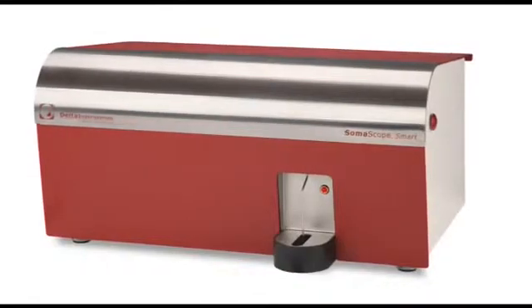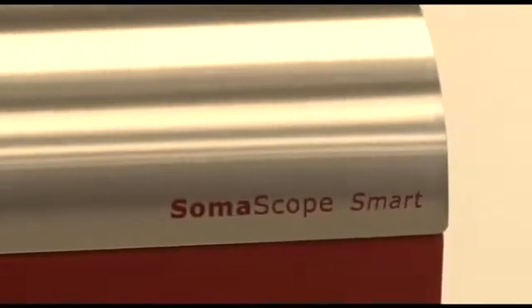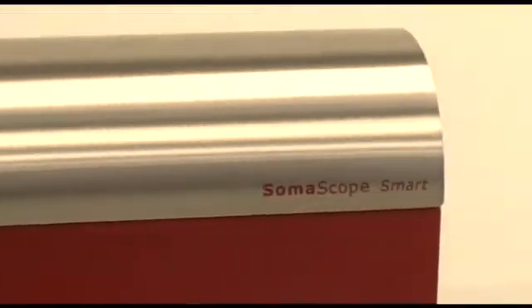The SomaScope Smart is a smart and easy to handle instrument. It's specifically designed for the analysis of somatic cells in raw milk on a small scale. It's based on flow cytometer technology.